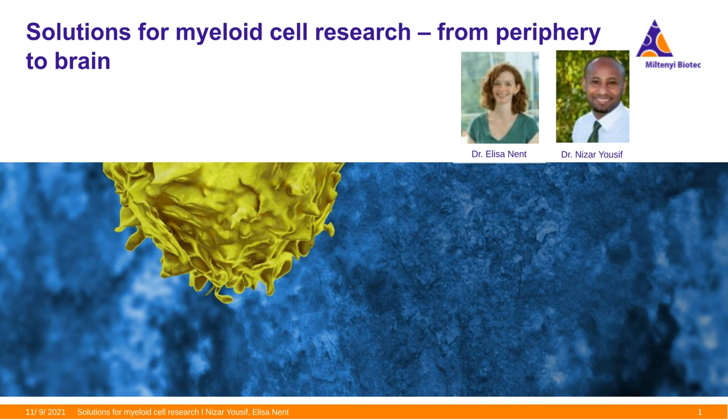Our first question is, I would like to isolate human neutrophils from whole blood, both normal density and low density neutrophils. Would it be possible to do that with the Express kit you presented?